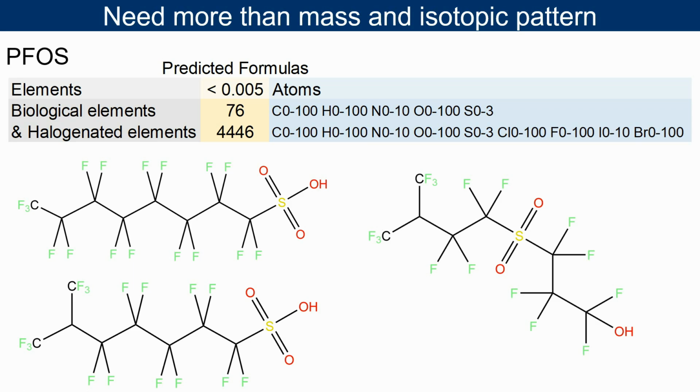So that can be a challenge for you guys, is to draw as many structures as you can for PFAS and just see all the possible structures that you can make. And they're quite close to infinite. There's quite a lot of structures. Of course, most of these won't occur and be manufactured by humans, and so we can narrow it down just by knowing what's the most common type. But that's still, we would like to know, especially since we're doing non-target analysis and we don't want to make assumptions, what the real structure is with more information.